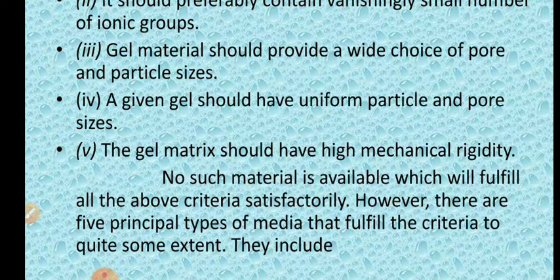The gel matrix that we are using should have mechanical rigidity. It should not be fragile. It should not break easily. Now, there is no such single material available which can fulfill all the criteria. However, there are 5 different types of gel media which are used for carrying out gel filtration chromatography.